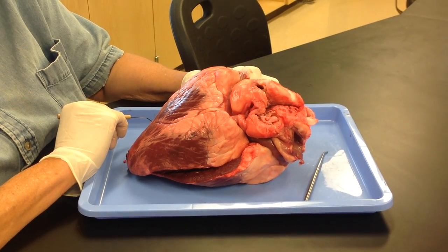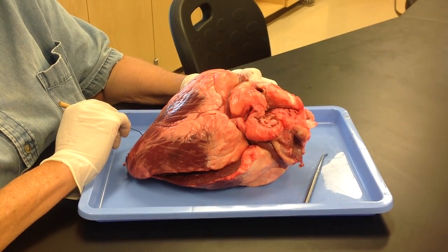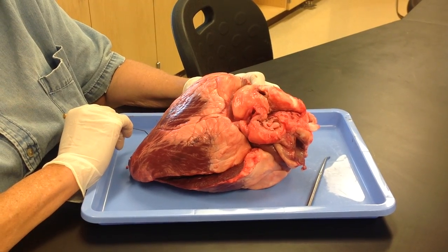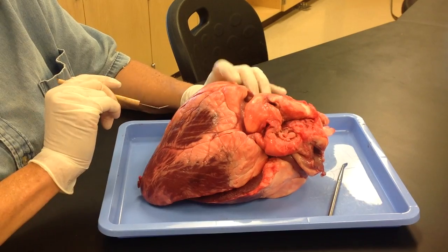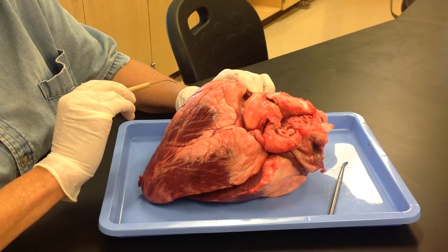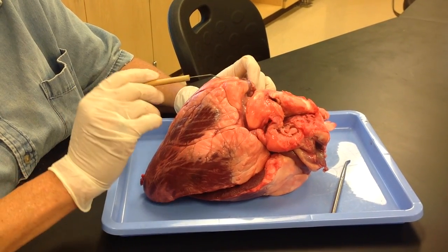This is a beef heart, and we're going to go over the parts of the beef heart that you would need to know for the practical. I'm going to go over them fairly quickly, but we did do it in class, so hopefully it will be a good review for you.